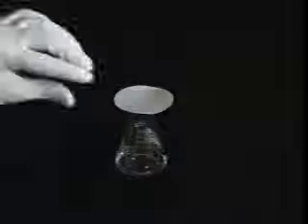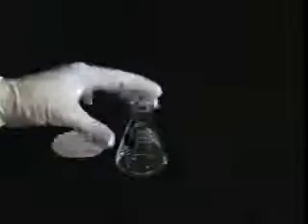If the solution reaches room temperature without crystal growth, you may want to try a trick or two to jumpstart the process. First, try scratching the side or bottom of the flask with a glass rod. Don't press too hard or you'll break it. If that doesn't work, try adding the seed crystal that you set aside at the beginning.